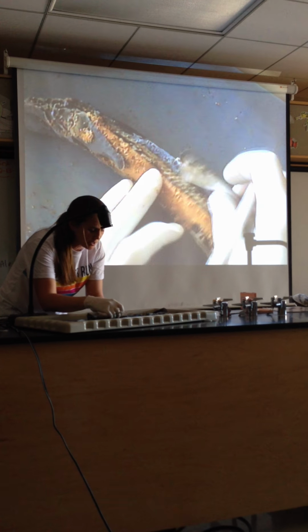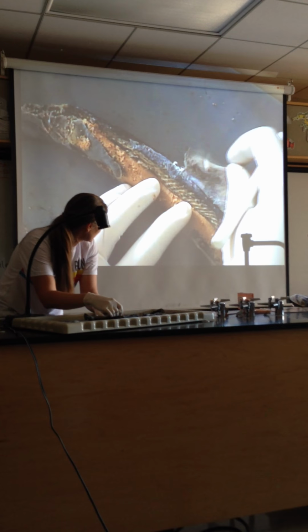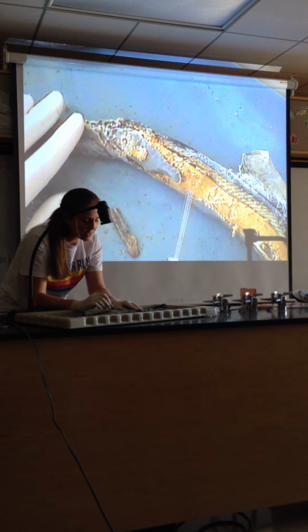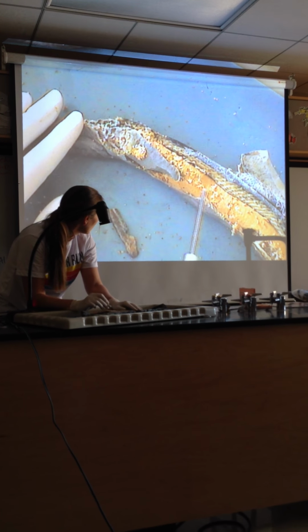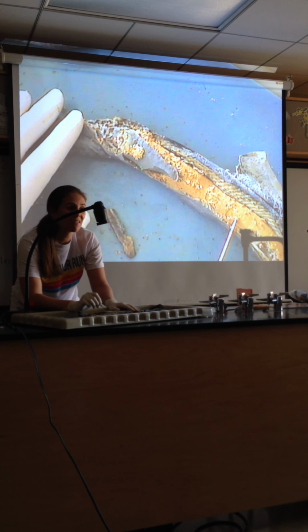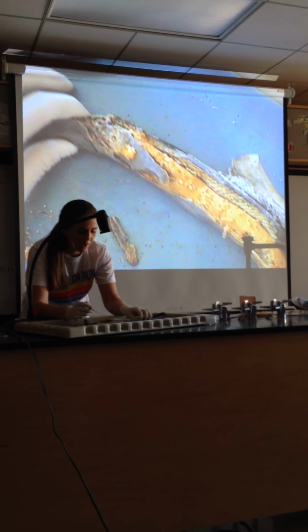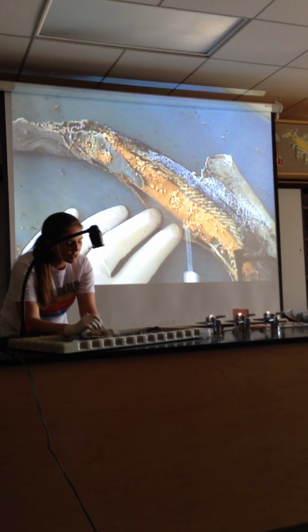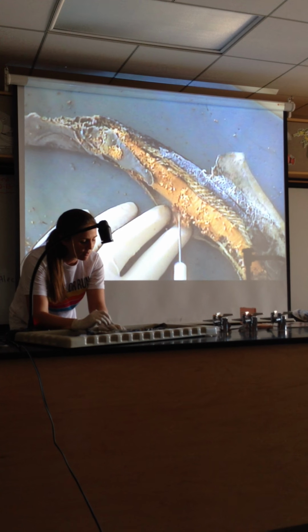When you look at this particular portion of the organism, you're going to skin it, and this is what you can see here. It kind of sounds like Velcro coming off. This whole structure right here, these are all eggs. All of those are eggs. If you don't have these, you obviously have a male. In order to find the intestines on the female with all of these eggs, you kind of have to gently remove some of the eggs.